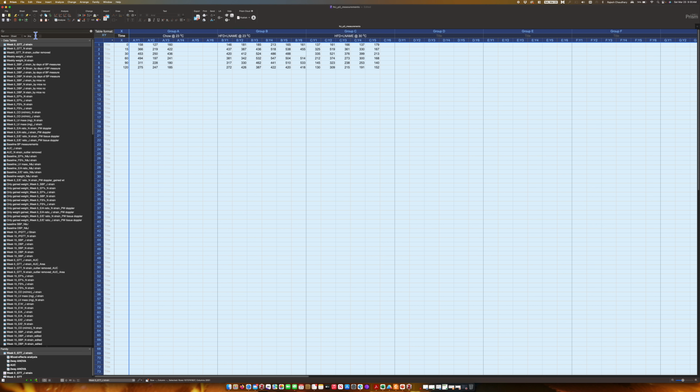Once the data is copied, we need to put these data as individual animal data in a new graph. So basically in a new table, I would say. So we go to this plus sign and then we choose a new table without the automatic graph. Once you hit that, you will get a table format, which is something like, let me show you.